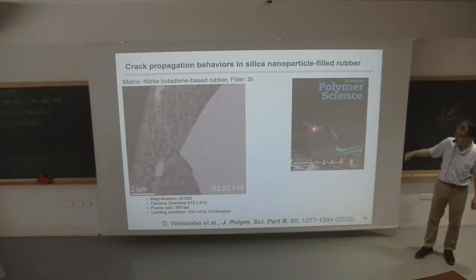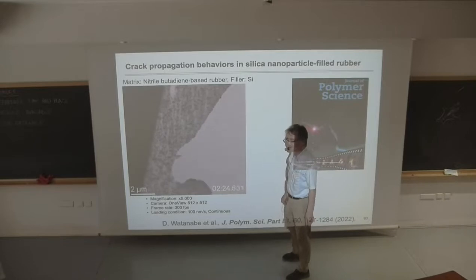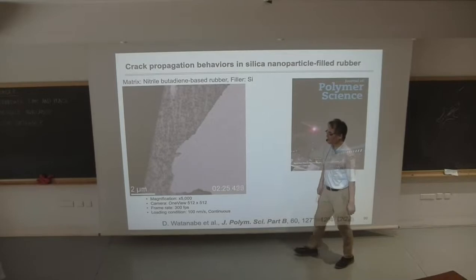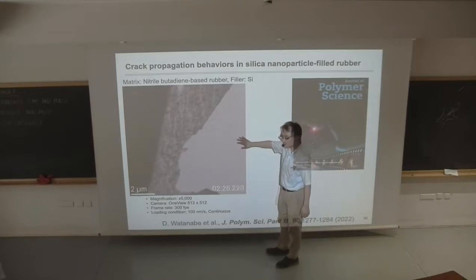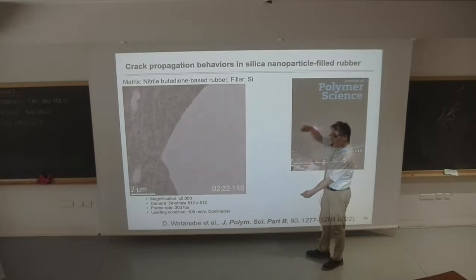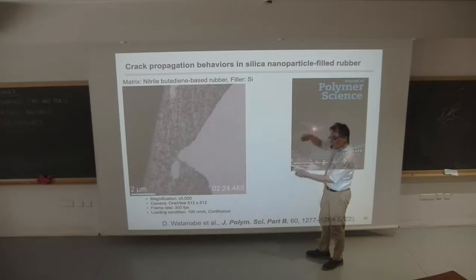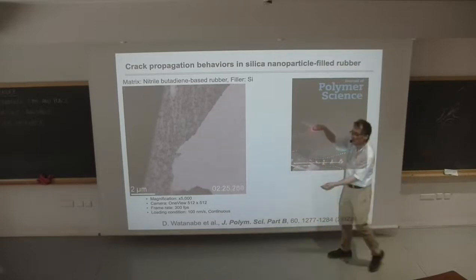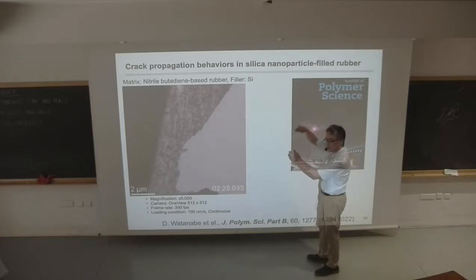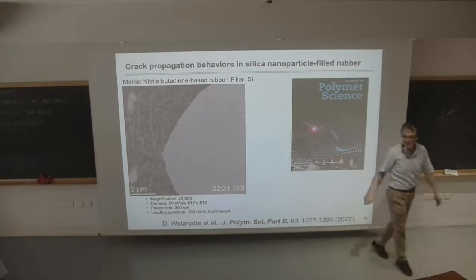So in order to go to the next, please. If you have a natural rubber, will you see the crystallization close to the tip with this kind of technique? Yes. Separate from this experiment, what we are trying right now is that we have a natural rubber or isoprene rubber without any filler, and then we stretch it to a strain of 4 or 5, and try to do the mapping that I'm going to describe in the next session. Then we know, at the high stretching, where the little crystal forms, and then how this crystal evolves. That's an interesting experiment. We are doing that.